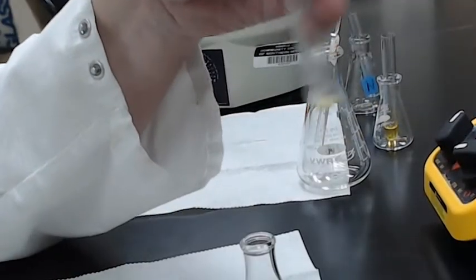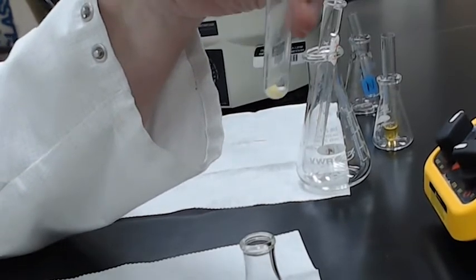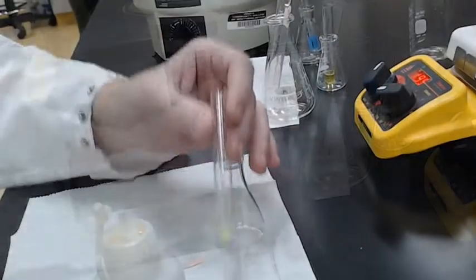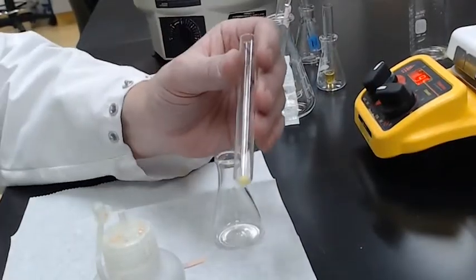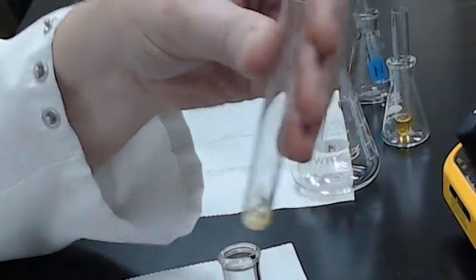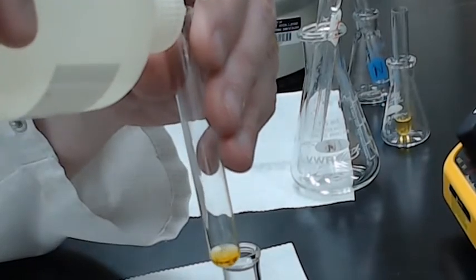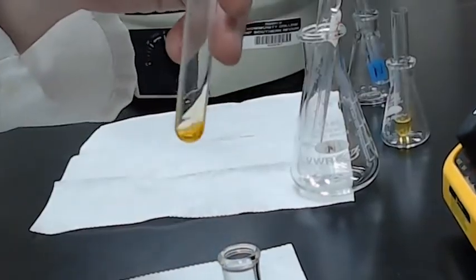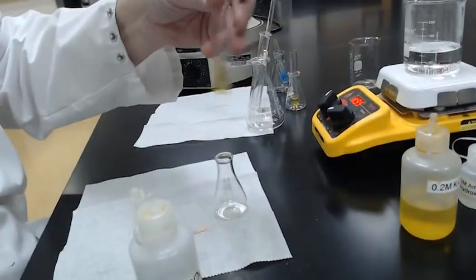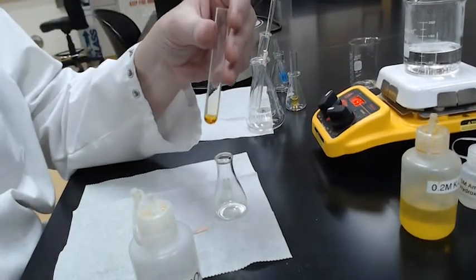So I've washed the barium chromate with the water. Hopefully that removed any calcium. And we are now going to transfer the yellow chromate precipitate to a white barium precipitate. So you add the hydrochloric acid and it should basically dissolve it, at least in part, and you'll see the solution's turning orange, the solid's starting to dissolve. Okay, and we get a lovely orange color as the chromate is shifting to a dichromate ion. Okay, it looks like it's shifted.